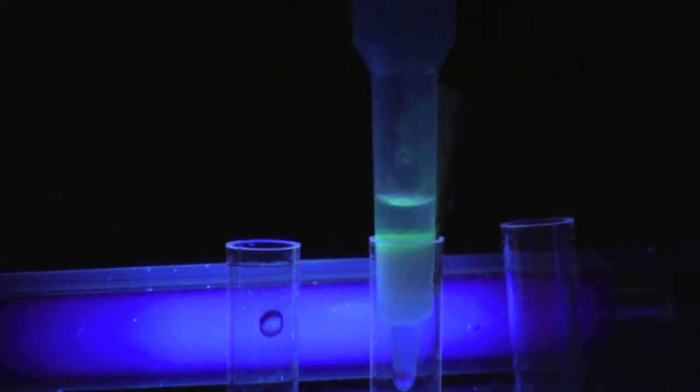Allow the buffer to drain until the bottom of the meniscus is 1 to 2 millimeters from the surface of the resin. Transfer the column to collection tube number 3.